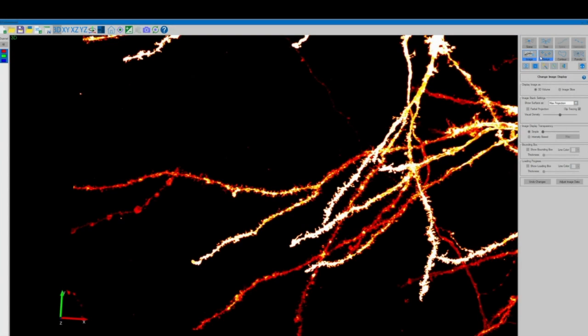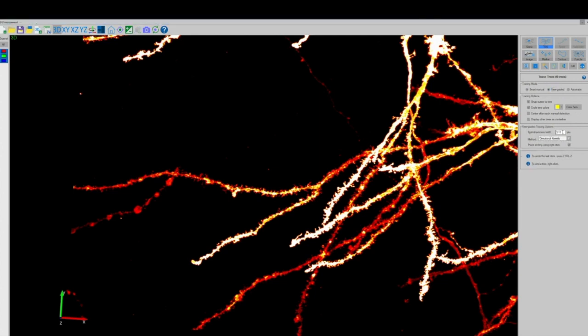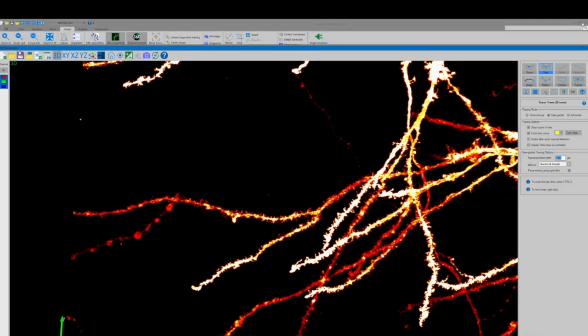Now for the purposes of our video we're going to skip past the automatic soma detection that NeuroLucida360 offers and head straight into user-guided dendritic tree tracing. So over on the right side of our screen we'll select tree, for tracing mode we'll select user-guided, and then in user-guided tracing options we're going to have to figure out our average process width.